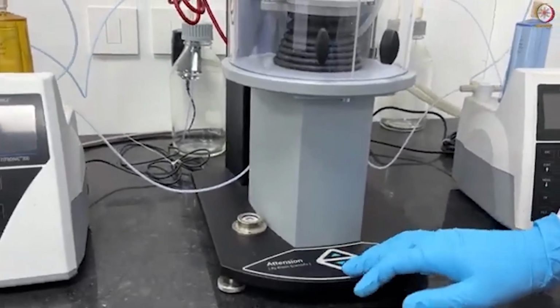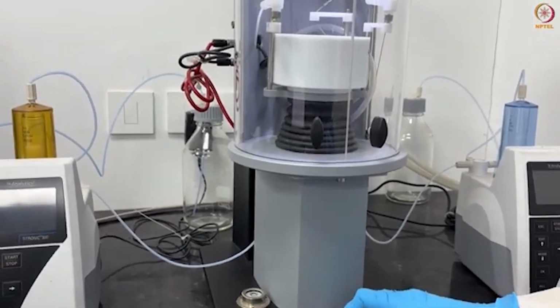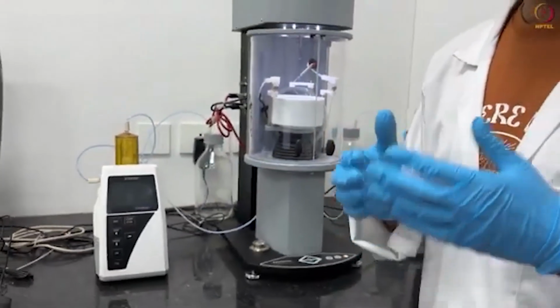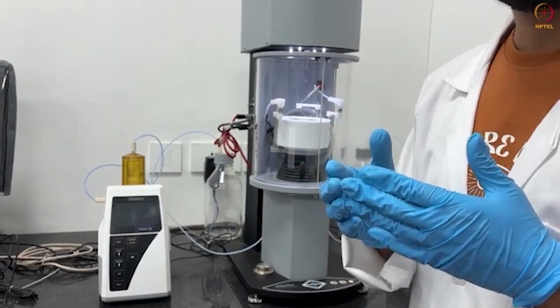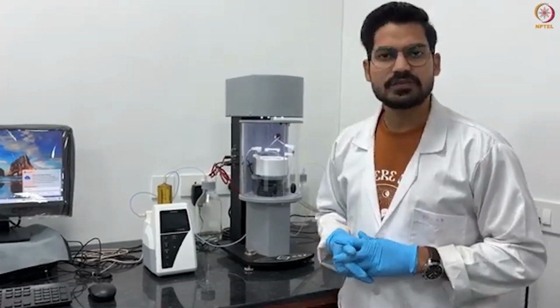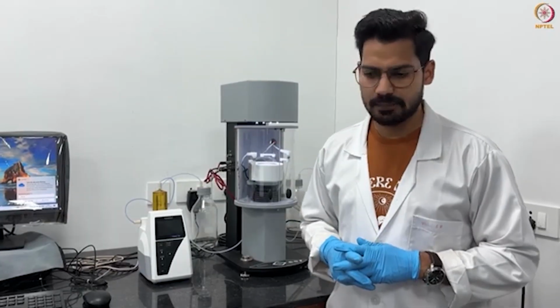Also, if someone wants to move the stage or the sample stage, it can be moved using these switches. As you can see here, our stage is moving upward. Now it is moving downward. This movement is used to adjust the interface of the ring type plate, Wilhelmy plate or whatever you want to use. Also, you can switch the system off or on during the experiment. And now I will show you the measurement of surface tension of an air-water system using a Wilhelmy plate and a ring type plate.